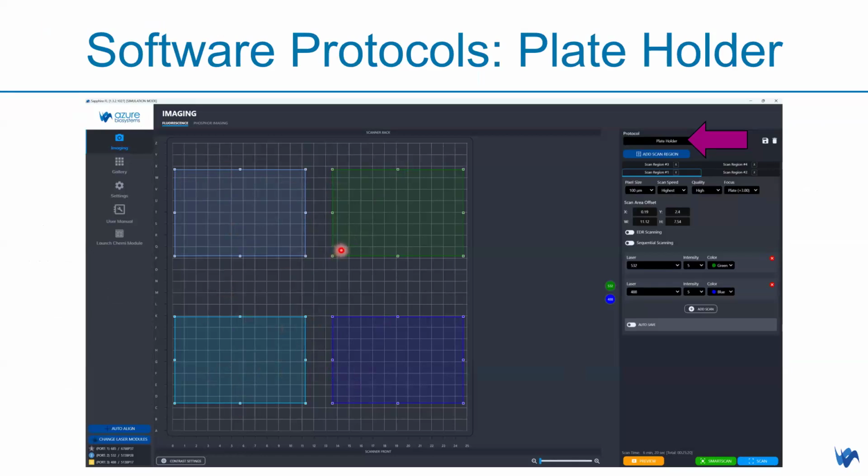You can put as many as you want to fill in your 96 well plates, and you just need to select or key in what kind of channels or scan speed or even the focus and pixel size, more importantly, pixel size or resolution, for each of these individual plates. Then you just click, let's say, auto scan, and then you can go for your lunch or do it overnight and go home and have a rest. And this 7 minutes is very quick for 100 micron resolution.